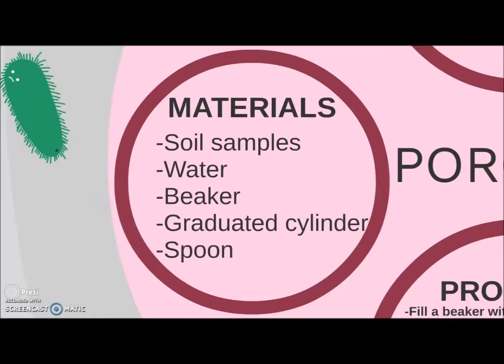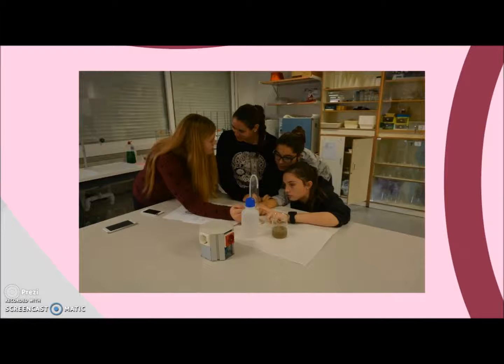Materials. Soil samples, water, beaker, graduated cylinder, and spoon. Here we can see classmates working in the lab.